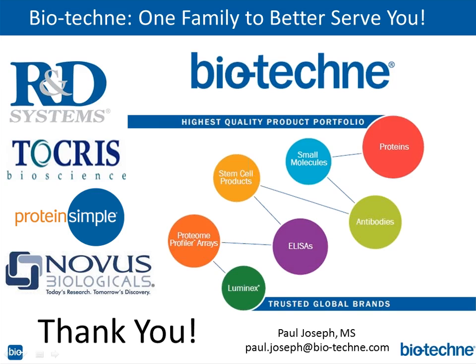Okay. And then Yeneth asks if increasing incubation times with primary antibodies would improve detection. Well, I think yes, but up to a point, because you think about it, you have epitopes that are exposed, and you're going to get saturation. The antibodies are all going to find their homes, and you're going to basically get a point of saturation, and you're going to max out.